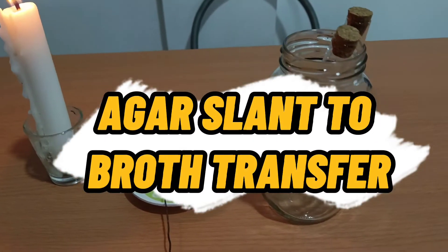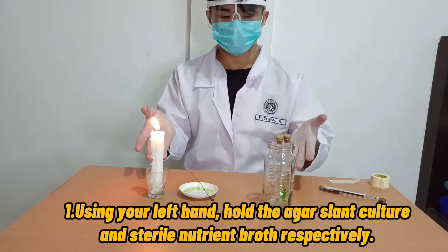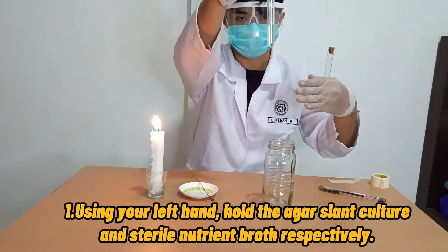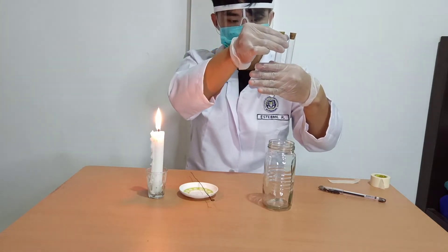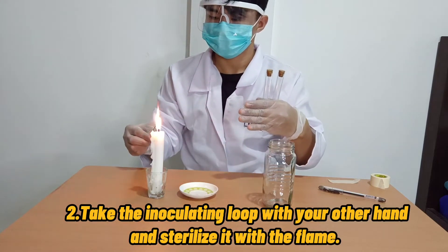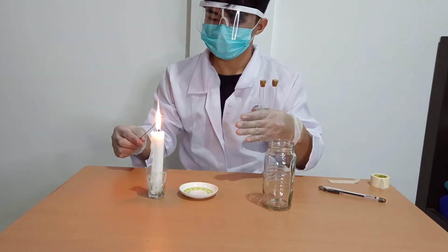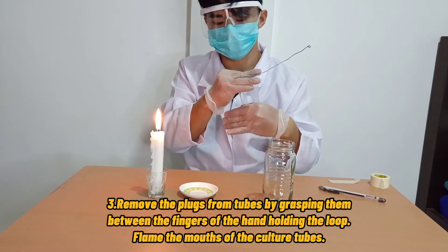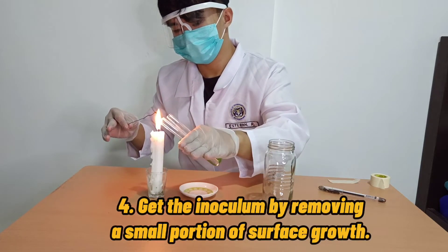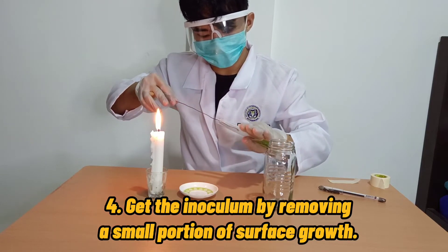Second is agar slant to broth Transfer of Culture. First, using your left hand, hold the agar slant and sterile nutrient broth. Hold the agar slant in the position that it faces you. Second, take the inoculating loop with your other hand and sterilize it with the flame. Third, remove the cotton plugs or cork from the tubes and flame the mouths of the culture tubes. Fourth, get the inoculum by removing a small portion of surface growth. Do not dig into the agar.